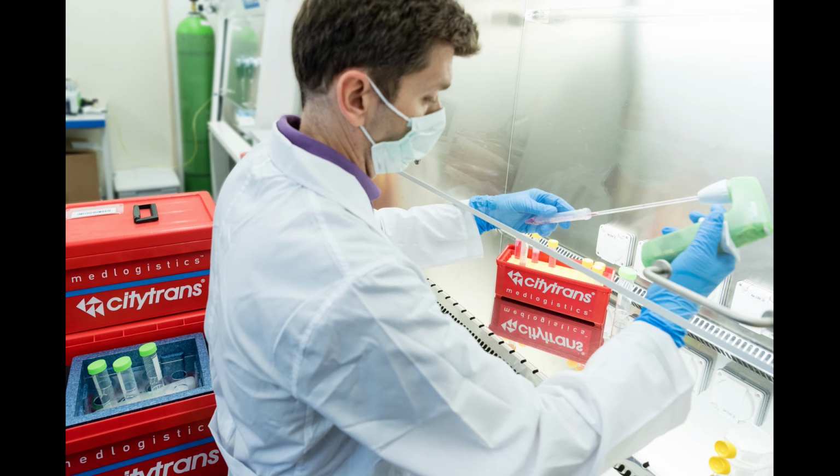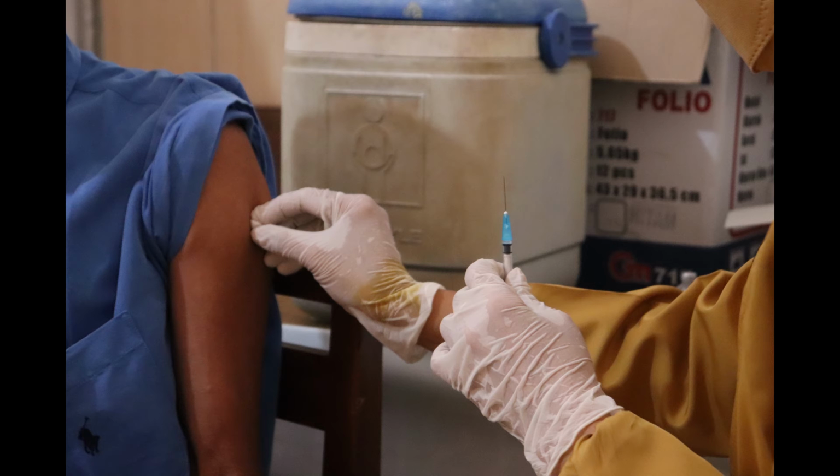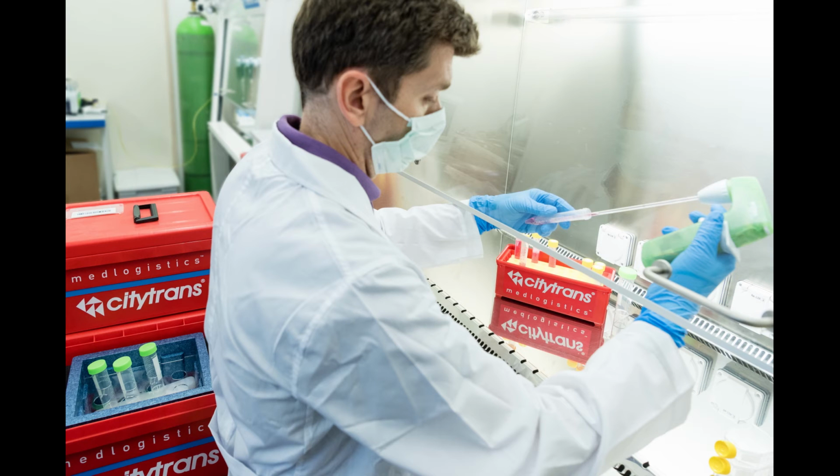On top of everything we've already mentioned, there are a number of requirements for containment within these facilities and use of them. Staff will often have to undergo regular medical checkups to ensure that they haven't been infected, and if it's possible, they'll be immunized for anything they're dealing with well before they start working there. As was the case with Level 2, access is extremely restricted and in fact often controlled based on when you should be accessing it and how.